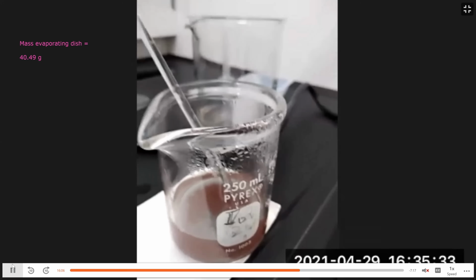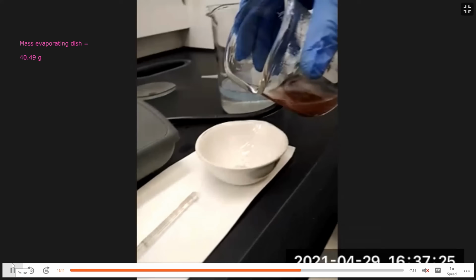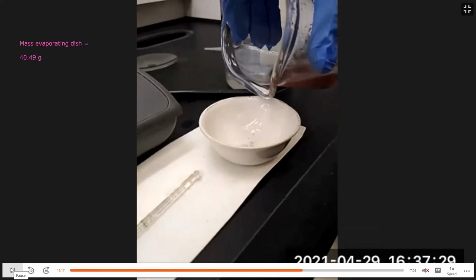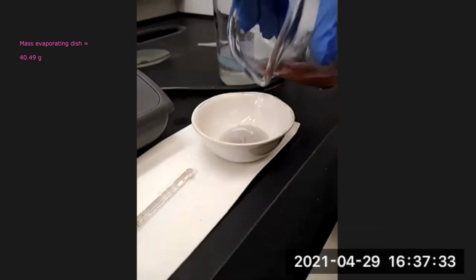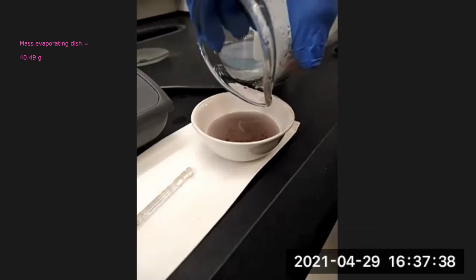We're very carefully going to put it into the evaporating dish. Swirl the beaker, get the copper moving from the bottom of the beaker.